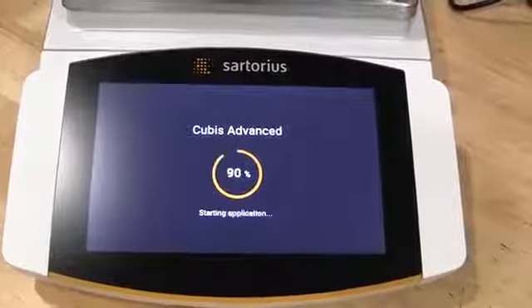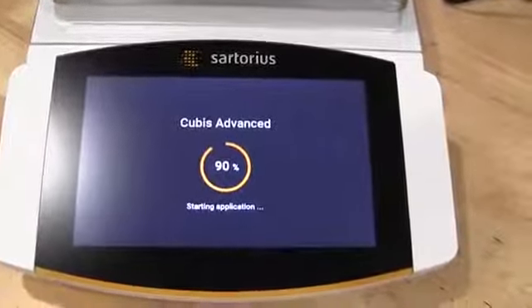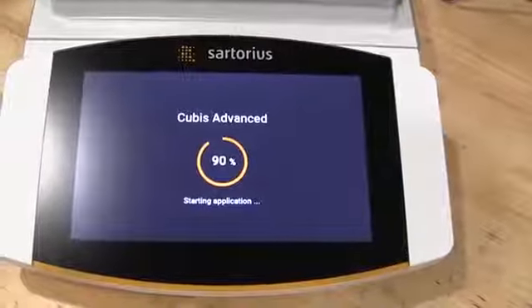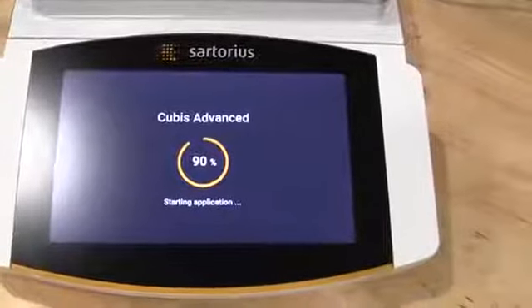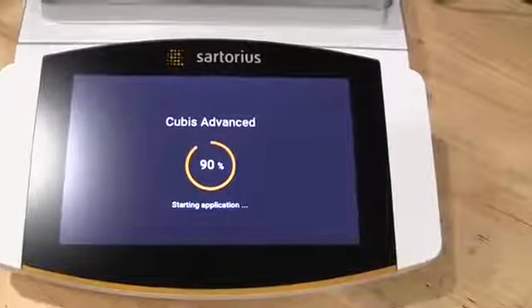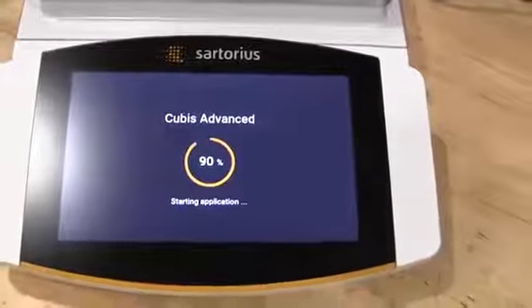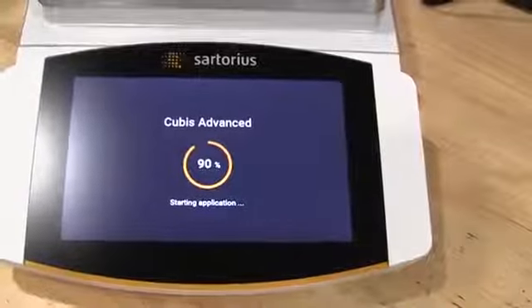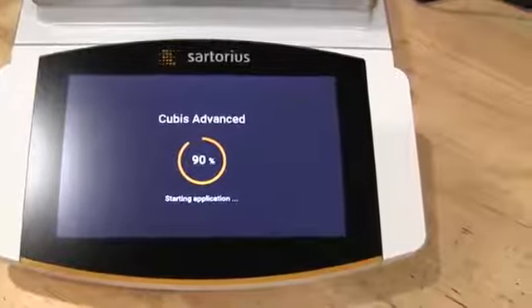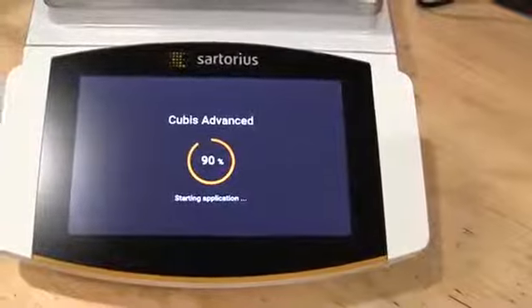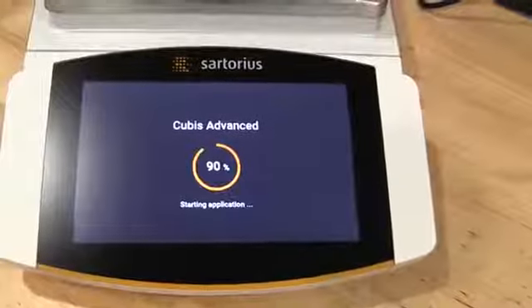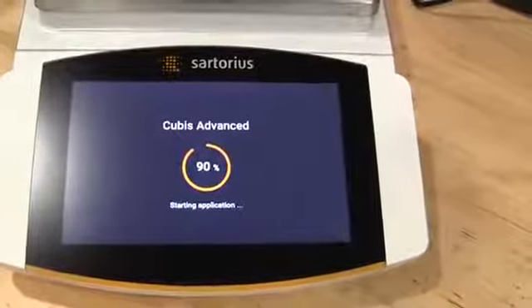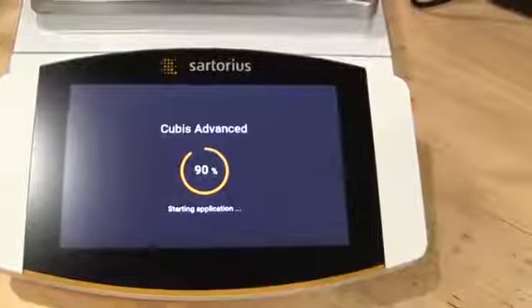Cubis Advanced. This is an extremely advanced balance basically focused for the pharma industry. It's a pretty complicated balance. Even going through the manual, I have a lot of experience with balances. It took me several hours to really figure out how to set up the balance for my weighing application.